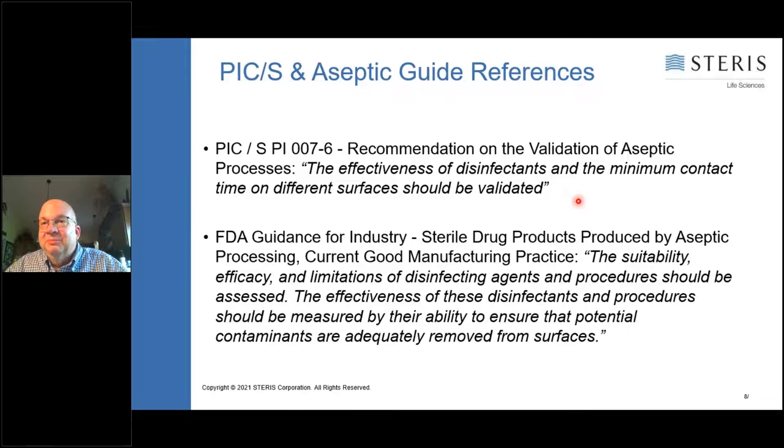I do want to mention a couple of other guidance documents. One is the PICS document, and the latest version of the PICS actually states that when you do your validation studies, you should be shooting for the minimum contact time. In many cases, that's 5 or 10 minutes. That's what we see in our industry.